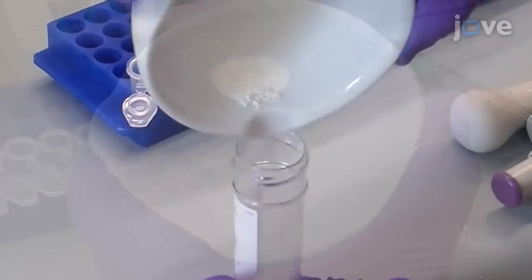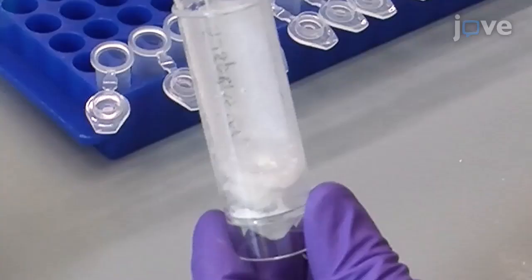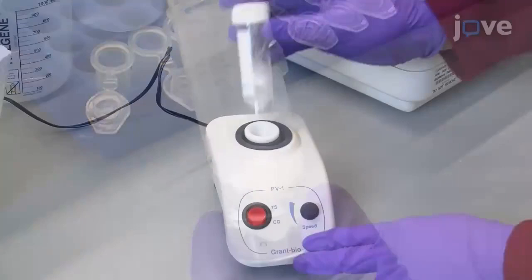Place the resulting powder into the labeled tube and re-suspend it in 10 milliliters of 100-millimolar phosphate-buffered saline, or PBS. Vortex the solution for one minute to maximize the enzyme extraction.